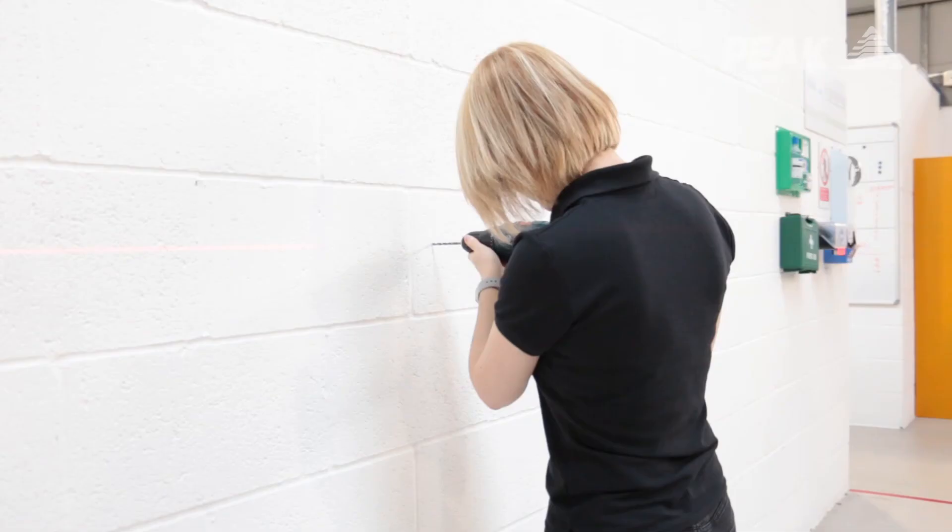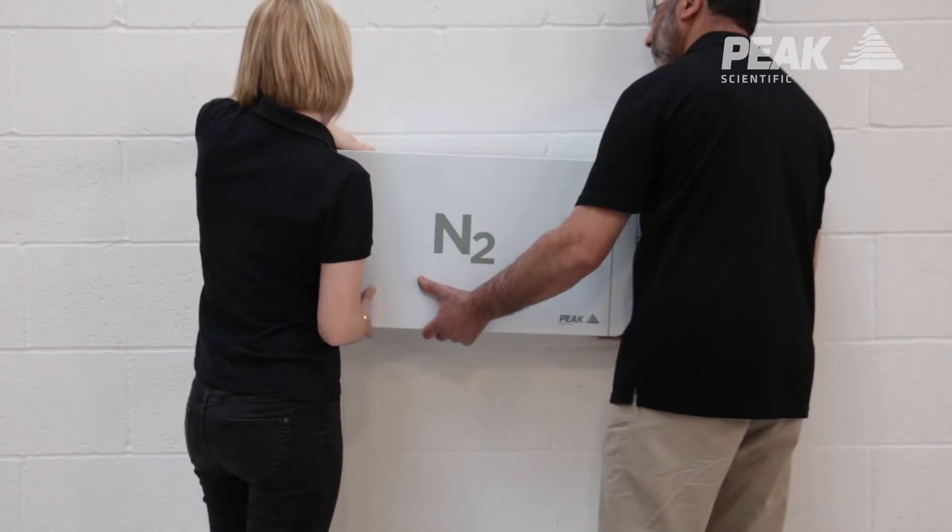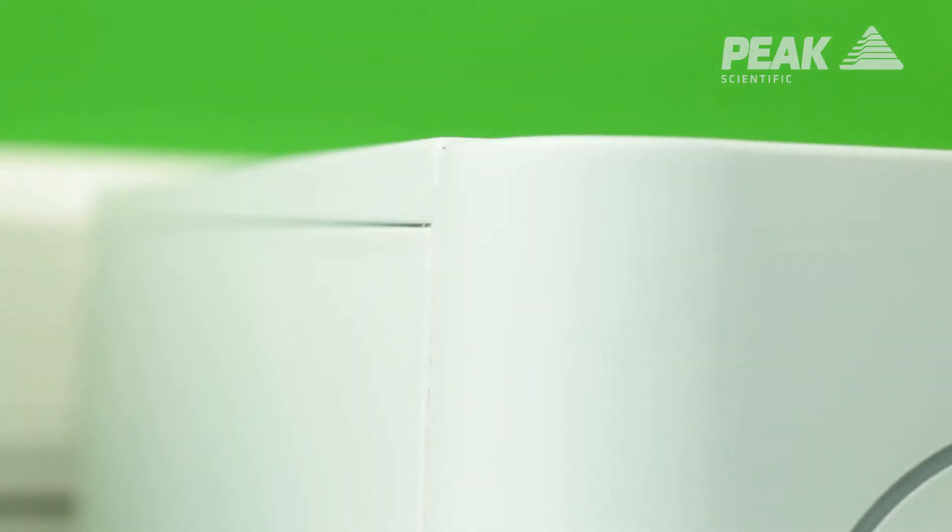The unit is also really compact, so it can be placed in several locations within the lab. It can be placed on the bench, on the wall, or it can actually be placed underneath another instrument as long as it weighs less than 100 kilograms, making it a space-saving solution within the lab.